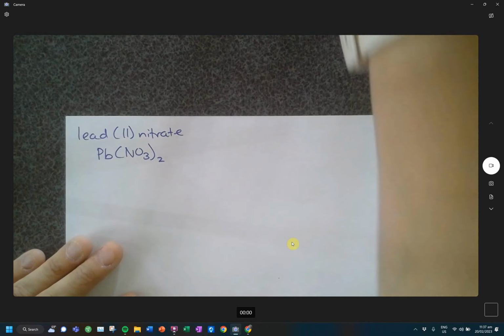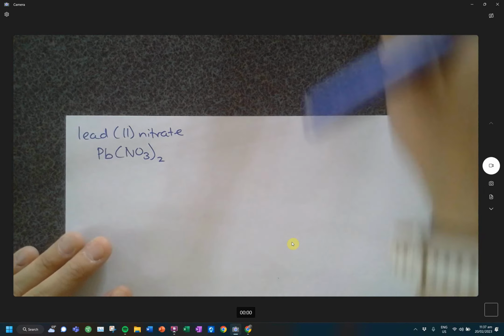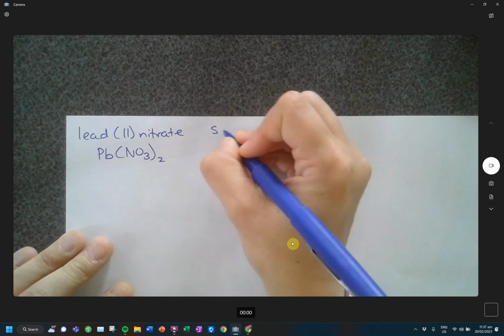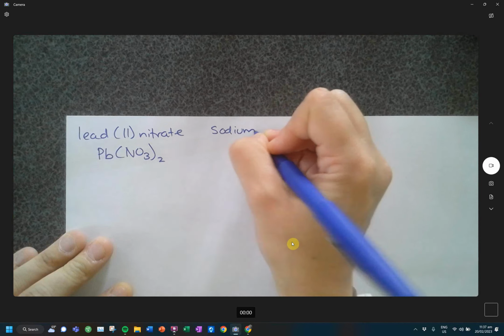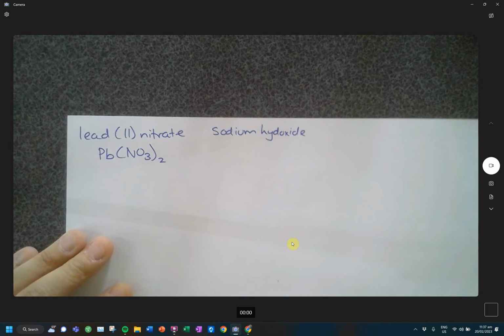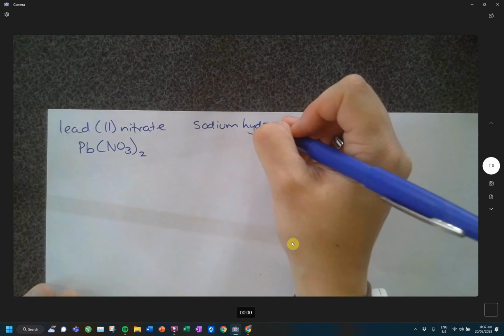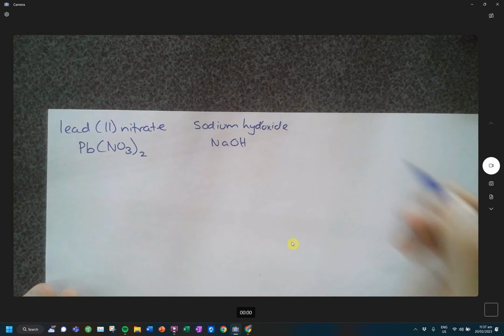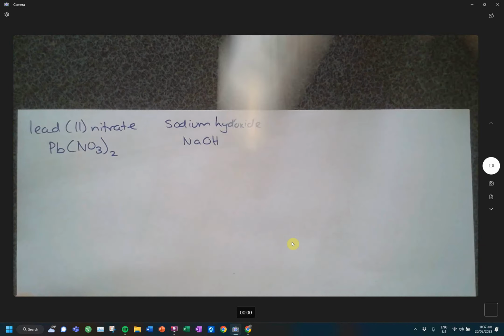The second solution that I'm going to be giving you guys is sodium hydroxide. Got the R in hydroxide. NaOH. It's this guy here.